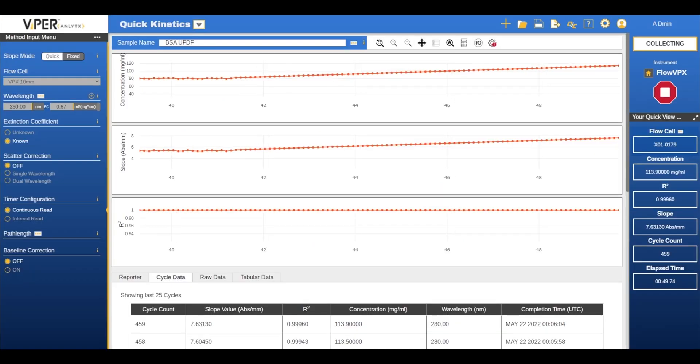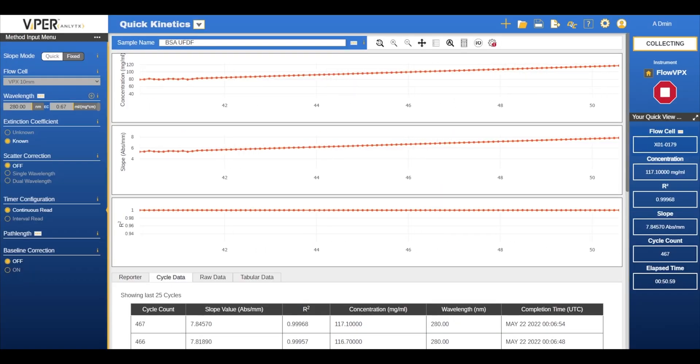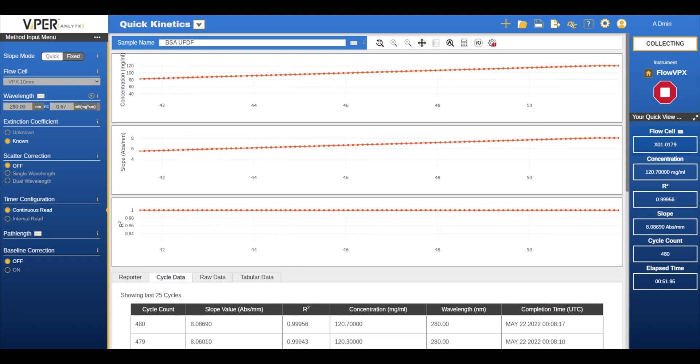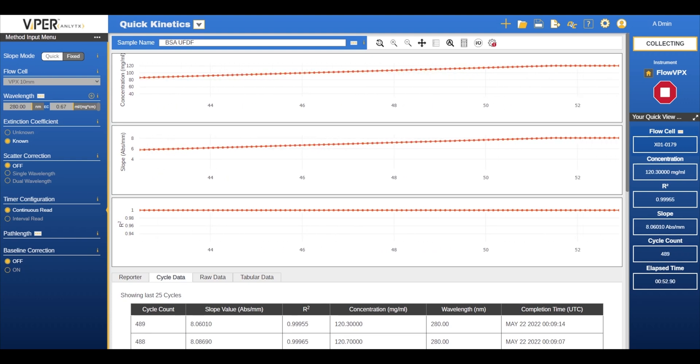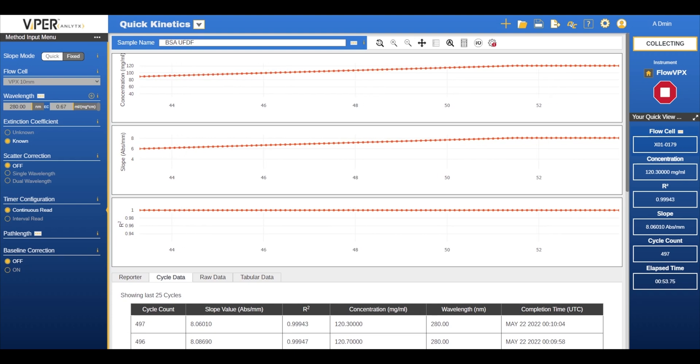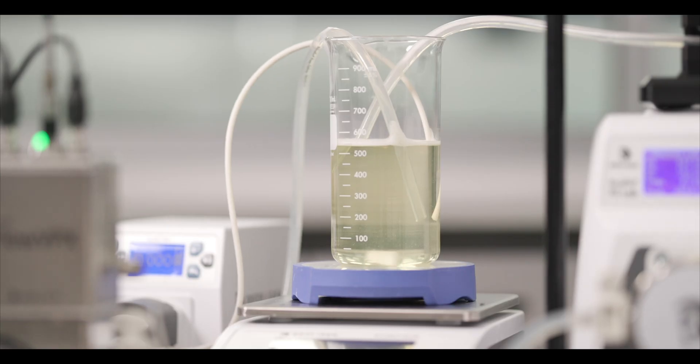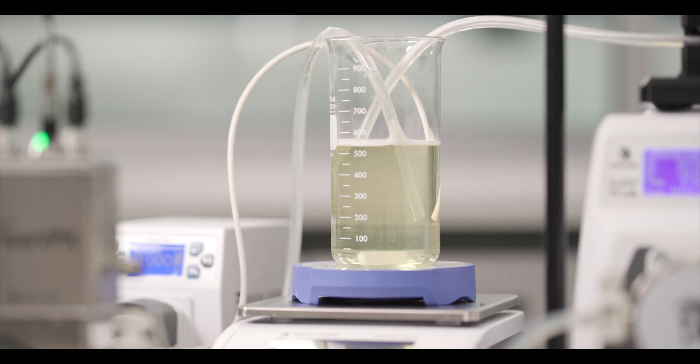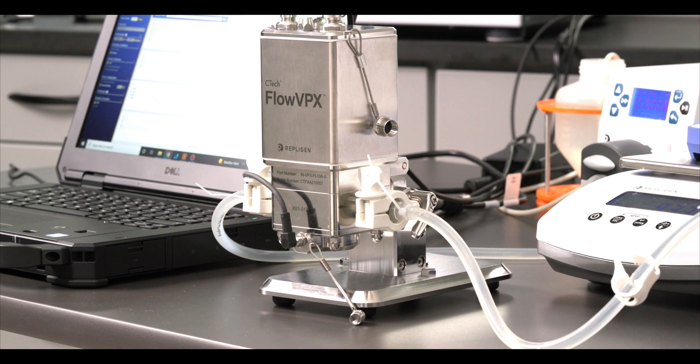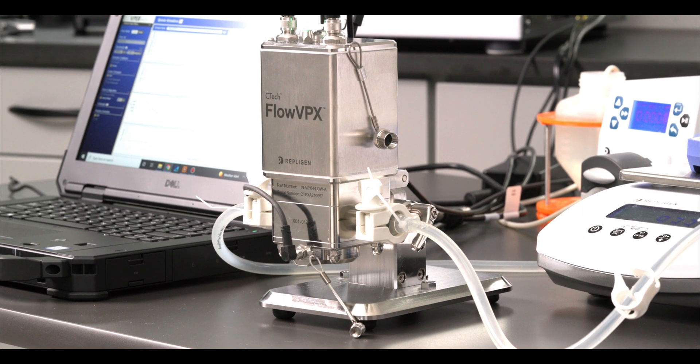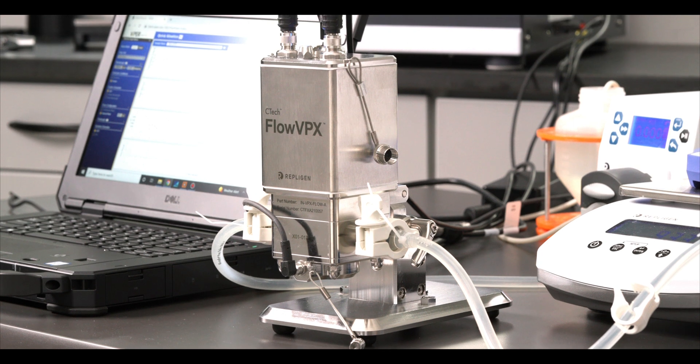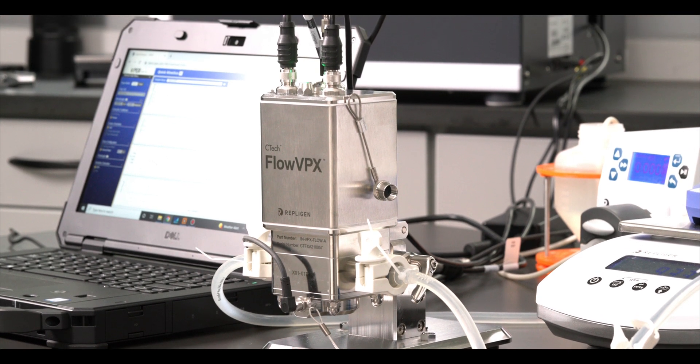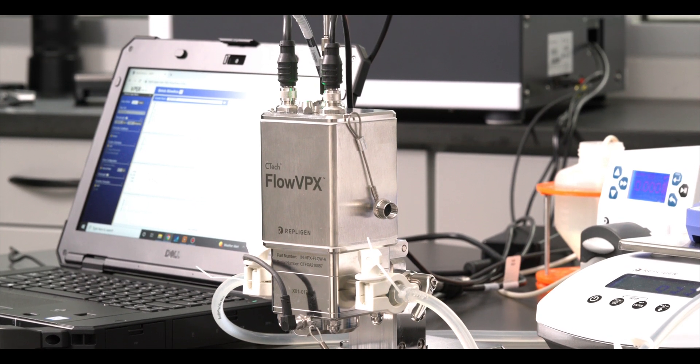Now begins the final ultrafiltration step of the run. I will bring the BSA solution to a concentration of 120 mg per ml. If you are measuring using only volume your final concentration can vary greatly, but using the FlowVPX system which monitors concentration you have a greater accuracy when reaching your final concentration.